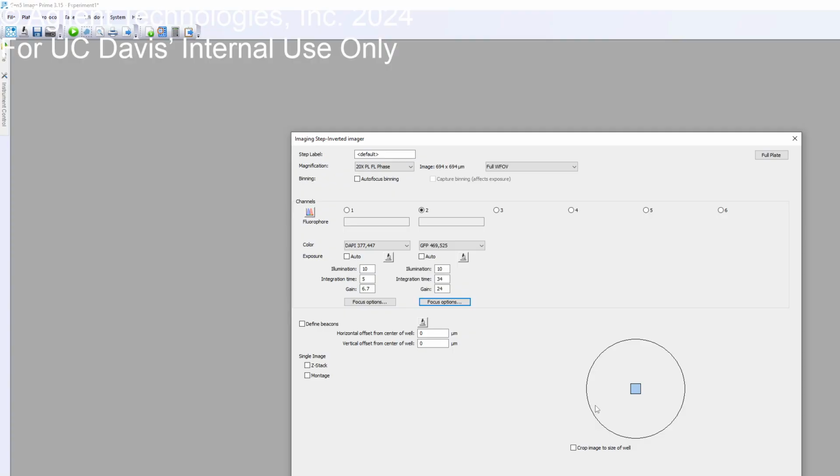And then if you wanted to apply Z stacks, or image montages, or if you wanted to apply beacons, so you want to image a 4x4 grid, I can show that to you later after lunch. But you can do imaging in so many different ways from here.